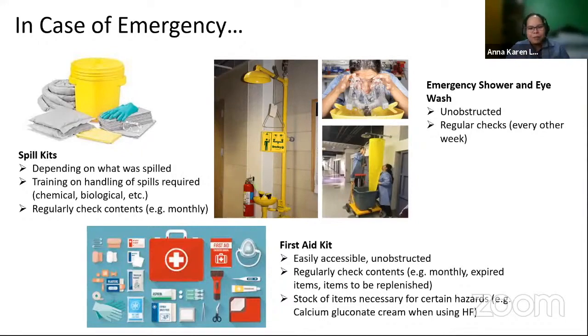Okay, so what I'm giving now is, as you can see, more of general laboratory safety. It's the usual things that you have to take note of when working in the laboratory. Every now and then I will jump into chemical safety or biological safety. These are the things that I mainly worked with when I was in Singapore, and most likely in my work currently. So it's more of general reminders, practical things that you have to take note of when working in the lab.